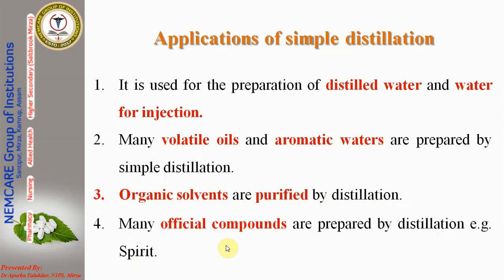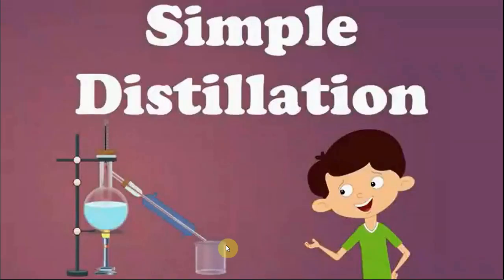Okay, let's see a video which will describe all the details about the instrument. Topic for today is simple distillation.